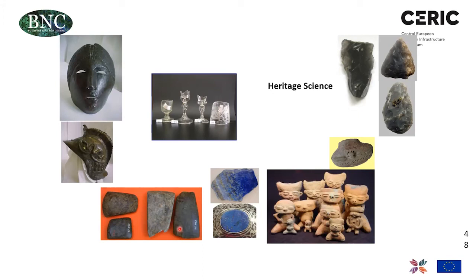provenance. So provenance study means that you try to trace back the origin of an object based on its composition or some trace element composition pattern. And by measuring the composition of these prehistoric stone tools, you can have a clue about the movement of people's population and their trade relationships between each other.